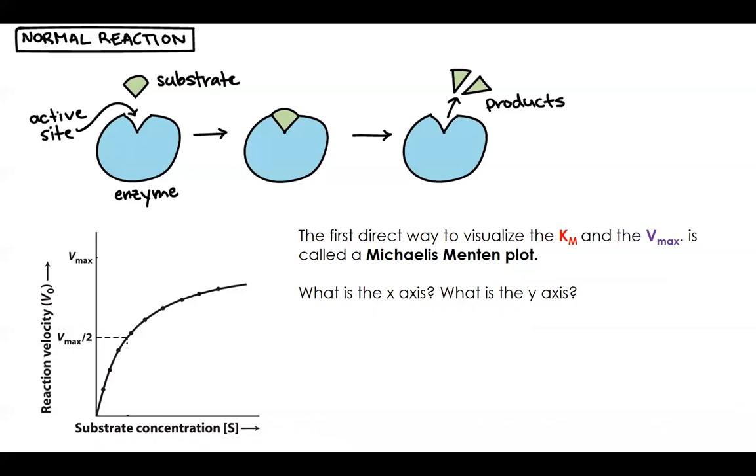Okay, here is our actual Michaelis-Menten plot. Basically we're collecting samples as we increase the substrate concentration. So low concentration, and we increase it to a high concentration, eventually to the point where we have basically inundated the enzyme with substrate. It has so much that the substrate is just available whenever it needs it, and that's where we can really observe that Vmax.